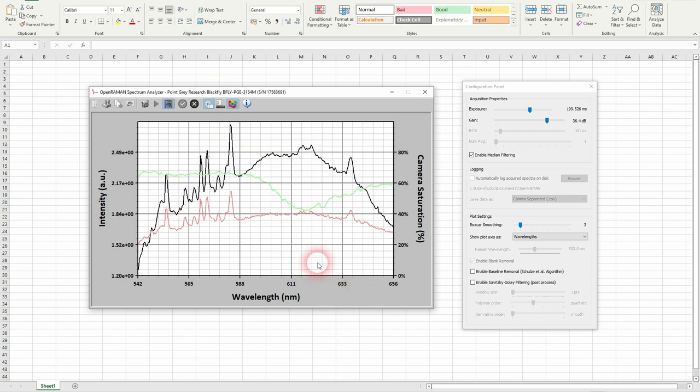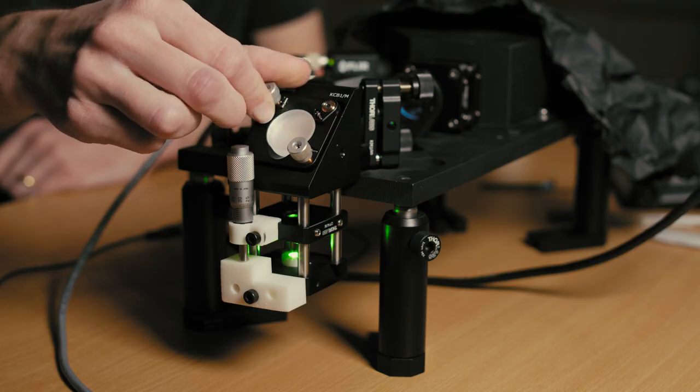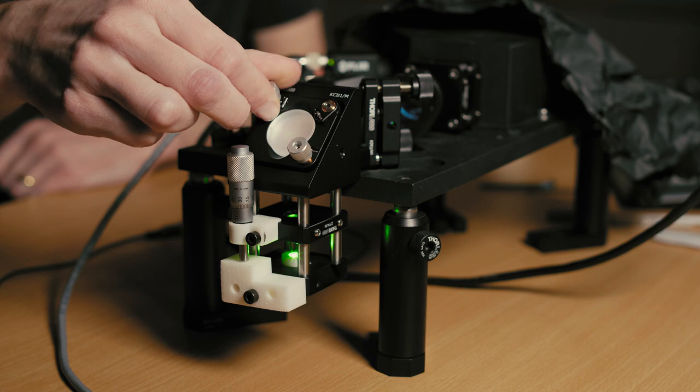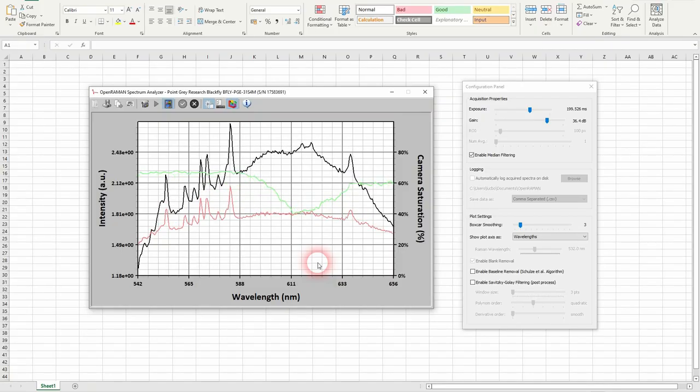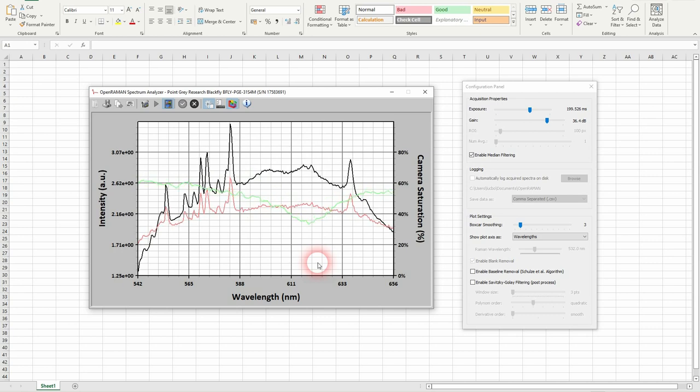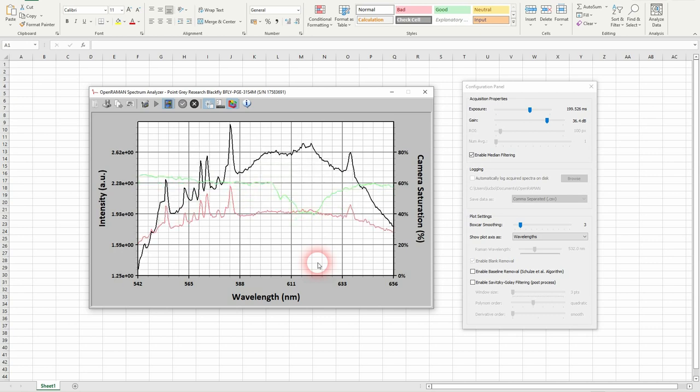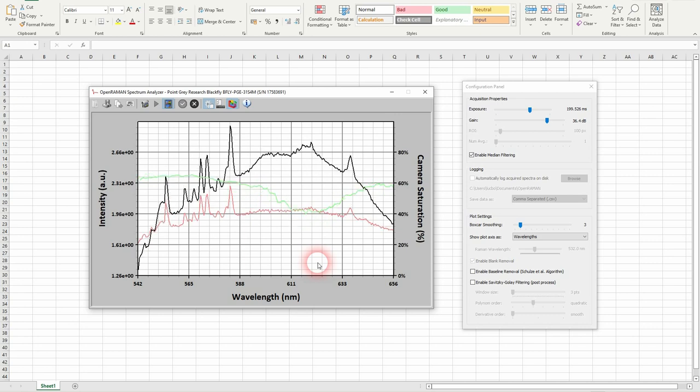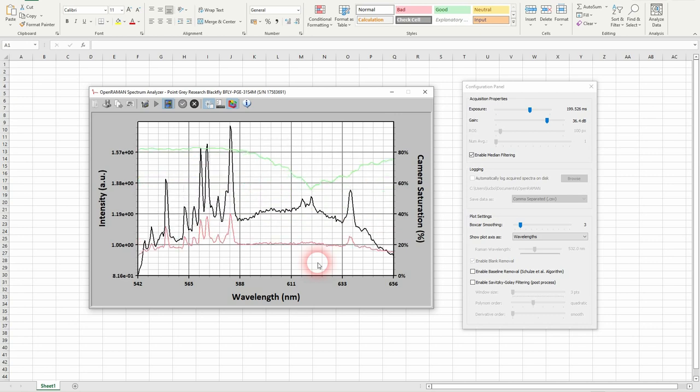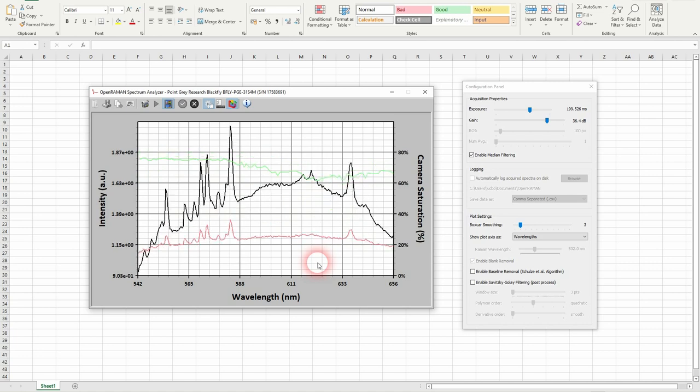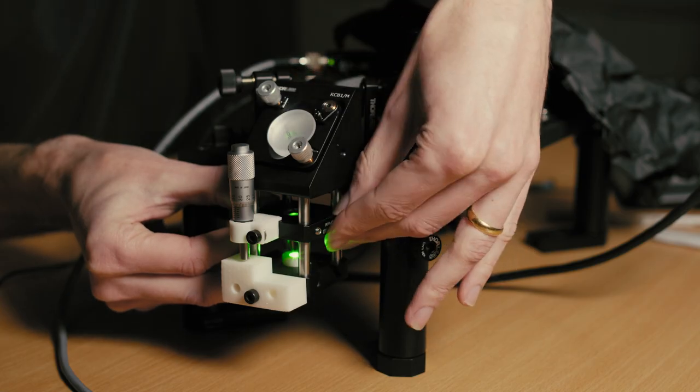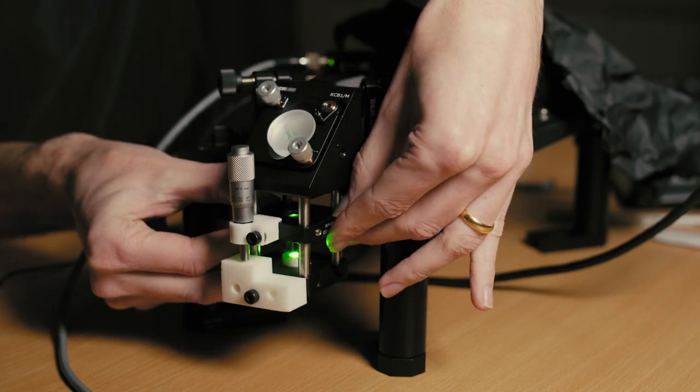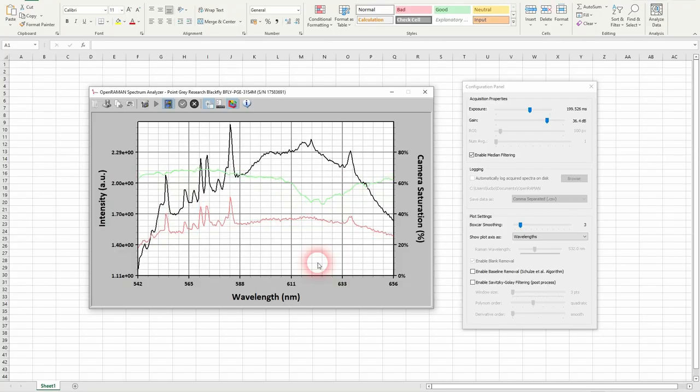So for example, this is worse. This is better. So you should be looking at the red and green signal.